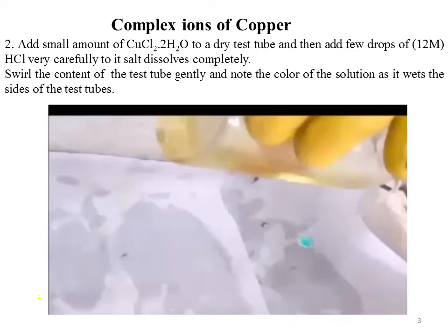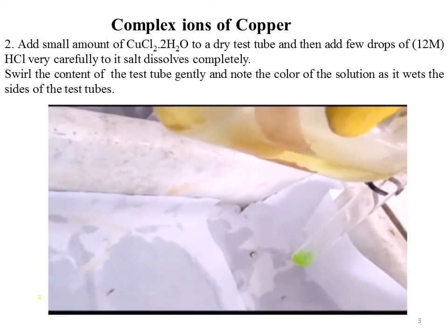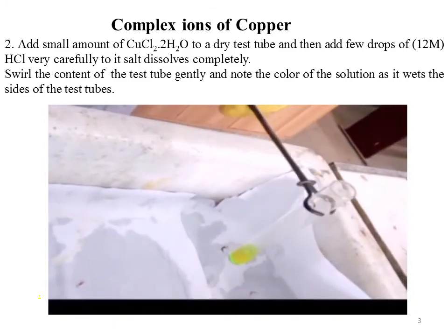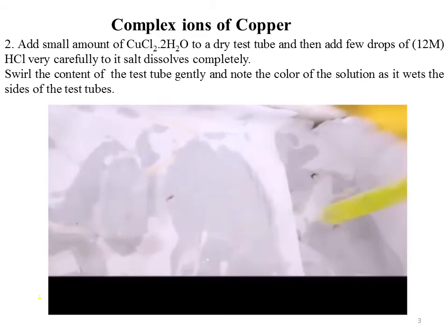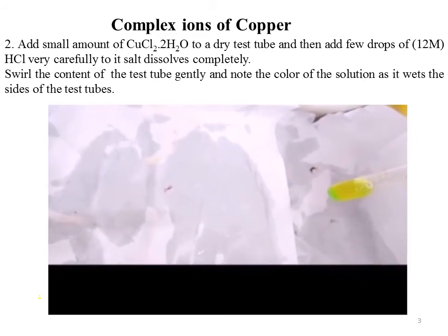Now watch this video. As the concentrated acid was added, the sea green colored salt turned to an olive green solution.